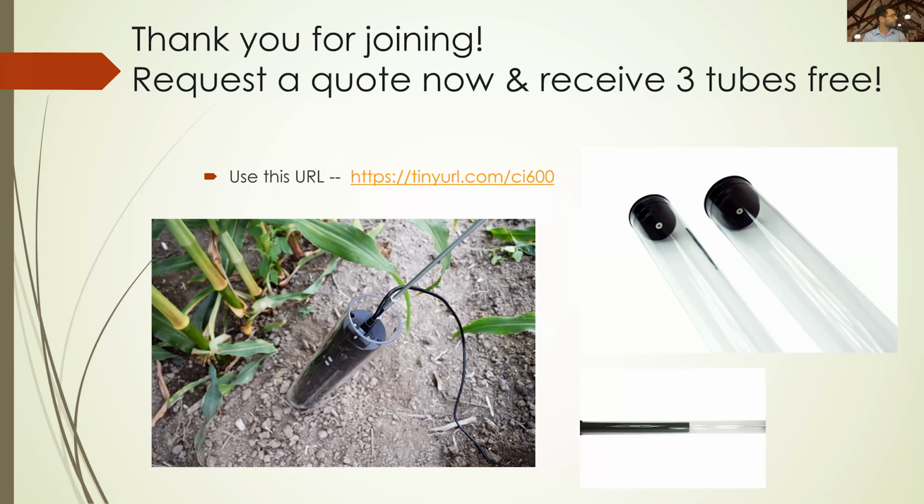So the first question I have actually shows up. Are there any improvements on the speed by which digital images can be processed? This is actually one of the things that we hear a lot from students. Even with the older technologies, the lowest DPI would take a long time to acquire data. The 600 has been around for 10 years. When originally established, we were using a lot older laptops and older scanner technology. Since the subsequent update, with laptops that have faster processing, we've actually seen the times decrease considerably, while also increasing the number of scans you can do in one area.